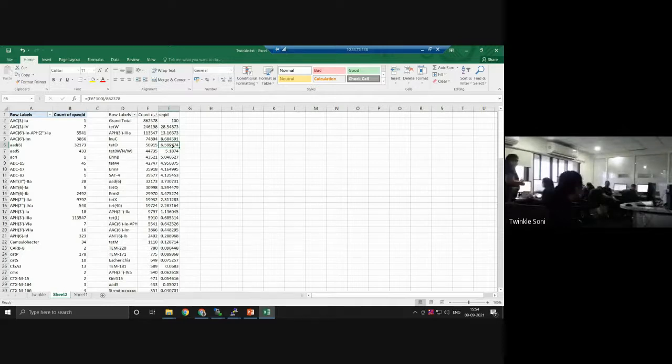I hope you guys understand. Okay. You guys can go for the ID, and later we will meet again over here to analyze this data in STAMP. The next session will be statistical analysis.